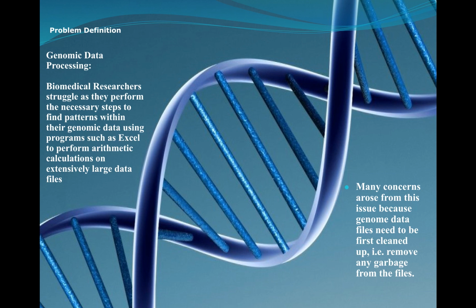So GenomePro was built to address a problem that biomedical researchers and medical researchers, biologists, have nowadays, because as a result of the genome project, where the entire human genome has been successively encoded and figured out, researchers are trying to analyze the data that they can find in human genomes to see if they can make any extrapolations on that data. For example, if they could find any patterns that suggest that a person has cancer, they would like to be able to do that.